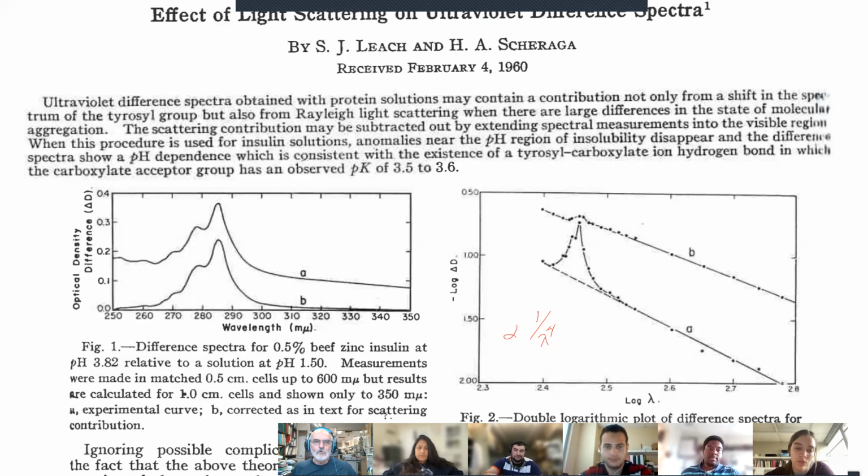The data didn't go through the 0 point correctly. It should have gone through a certain point at 0, and it didn't. And it suggested that there was something wrong with the concentrations in her plot of density versus concentration. It should have gone through the point of the density of the buffer, and it didn't.